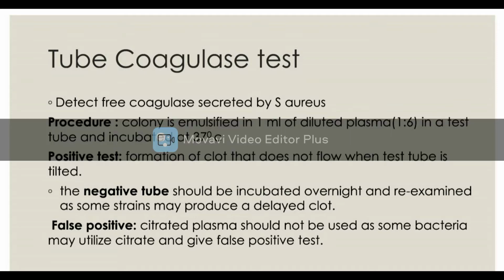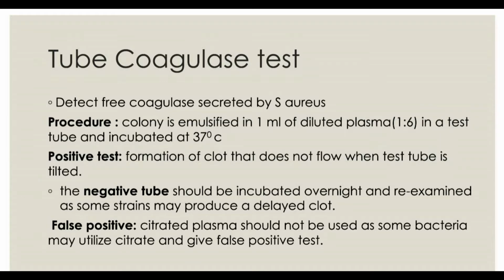In the negative tube, it should be incubated overnight and re-examined, as some strains may produce a delayed clot. So some show a negative result, but they should be incubated overnight and re-examined.